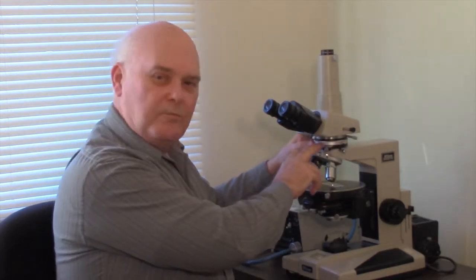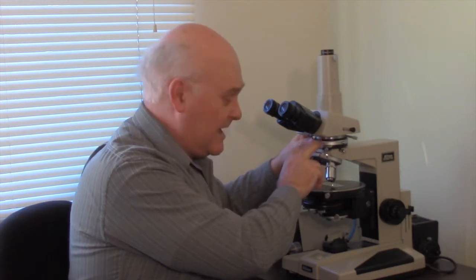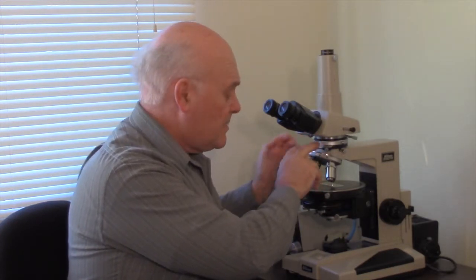Now let me explain why it's more than 400. In this particular microscope, the objective, the 40x objective, will magnify 40 times. As the light travels through the microscope and gets into the intermediate tube, remember this is a polarizing microscope, so we have an intermediate tube that contains the analyzer, one of the polarizing filters. This intermediate tube magnifies again by about 1.25 times. And in different types of microscopes, it will be a different function, a different multiplication.